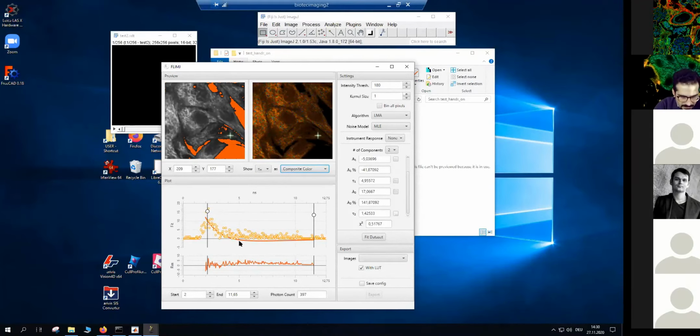Just one thing that I'm wondering about is this one here. It's a very interesting phenomenon that's happening. When I'm trying to fit this value, the fitted curve actually goes to a minus value. So it's like -2 or -3. I have no idea what that means. And also here in the lifetime, the very reddish lifetimes are something like minus values somewhere. So this is also a very interesting point to see why this is happening. Is that actually how the algorithm is implemented, and why we get minus values here? It doesn't make sense, because what we have here is counts per time bin, and that cannot be minus. So that's what is clear.